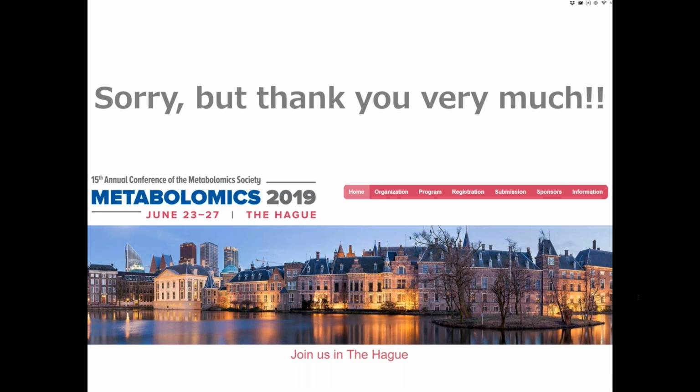I personally use the one with the bigger ion abundance, if there are two peaks. But it depends on the purpose of the metabolomics.